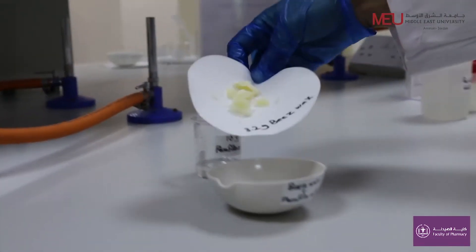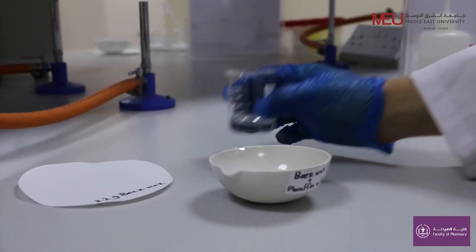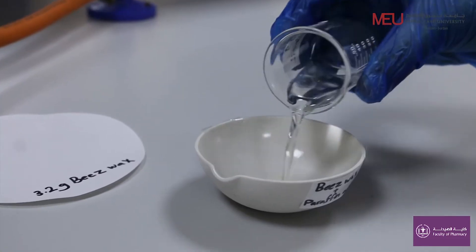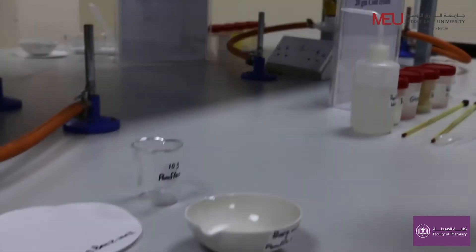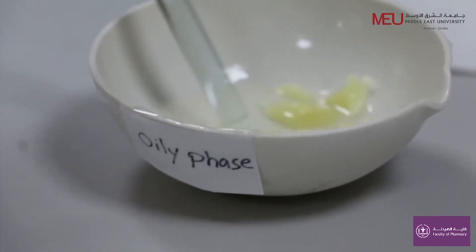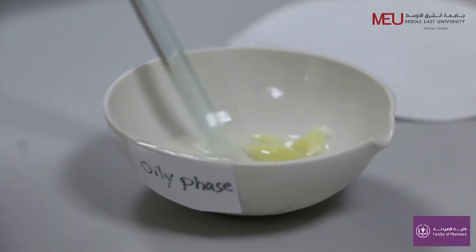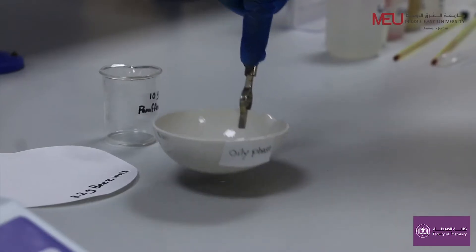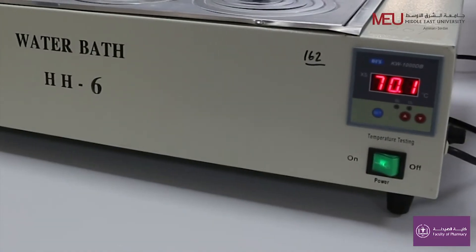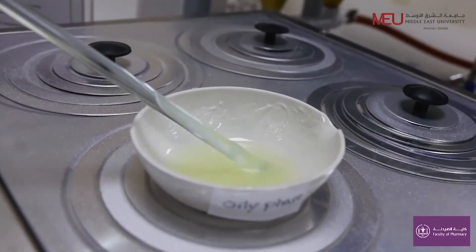Mix the beeswax with paraffin oil in the evaporating dish. Thus you have prepared the oily phase, which consists of beeswax and paraffin oil. Melt the ingredients of the oily phase using a water bath at 70°C, stirring continuously until both ingredients dissolve in each other.